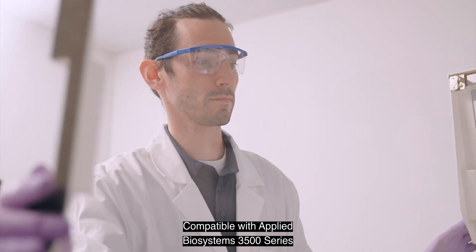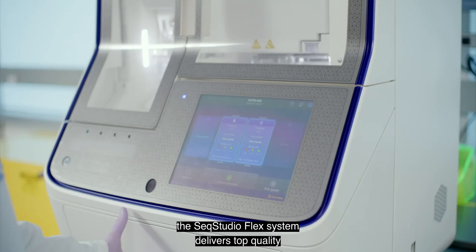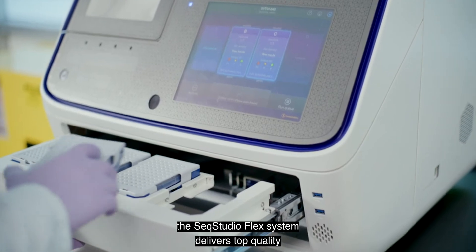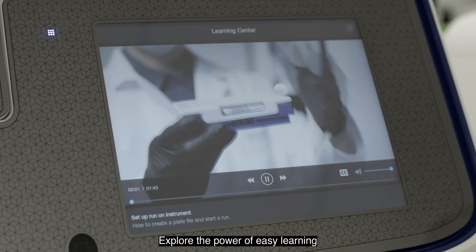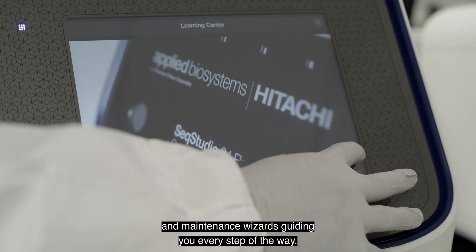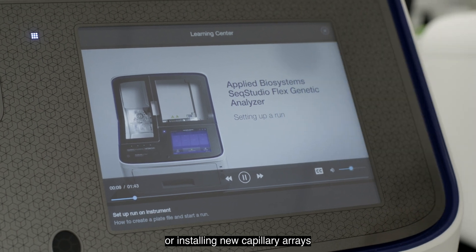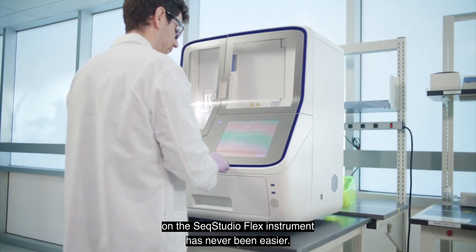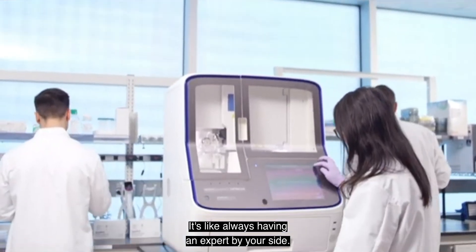Compatible with Applied Biosystems 3500 series genetic analyzer buffers and polymers, the SeqStudio Flex system delivers top quality and reliability. Explore the power of easy learning with its onboard learning center and maintenance wizards guiding you every step of the way — setting up a run, changing buffers, or installing new capillary arrays has never been easier. It's like always having an expert by your side.